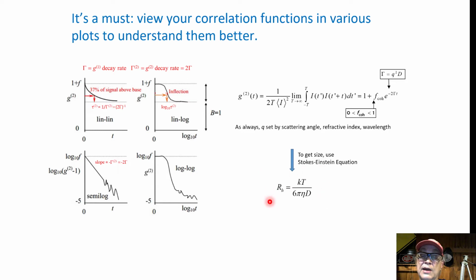And we can do that down to 5 nanometers, even less. Probably even 1 nanometer, somewhere in there, depending on your solvent and temperature and some other parameters. But this is a very reliable way to get size: measure the diffusion coefficient from this correlation function. But it is an exponential decay.